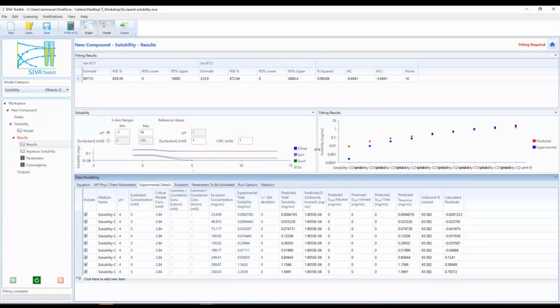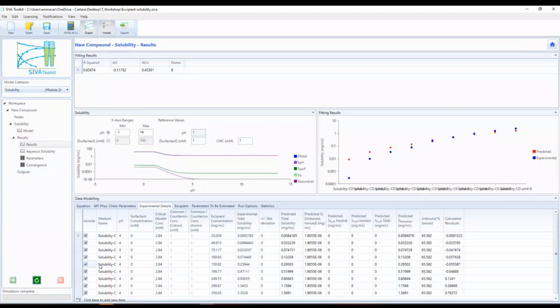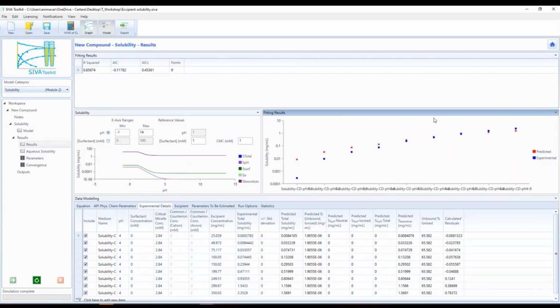So in this tab here, you can see these are. You can also run a simulation, by the way. So with the same parameters that are used here, you can run just one simulation without fitting. And then you can see the results are, again, not too bad, particularly for the higher concentration of the cyclodextrin, which is more likely to happen in the real scenario in vivo. So it's obviously depending on the case and the formulation, basically the drug that you are modeling.